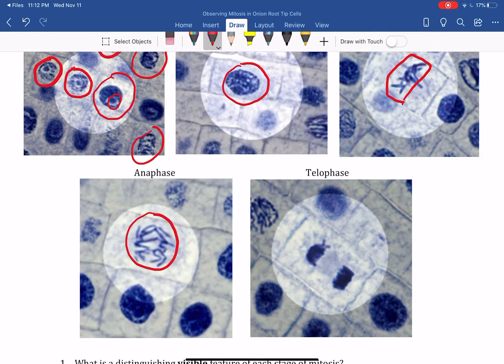And then telophase - here's one cell. This has got a cell wall so that's kind of why it's squarish looking, because it's a plant cell, an onion root tip cell. And you see the two new cells that are starting to form yet. We don't have cytokinesis or anything like that yet going on, but this is the nucleus starting to reform in what will be two new cells, and that's telophase.